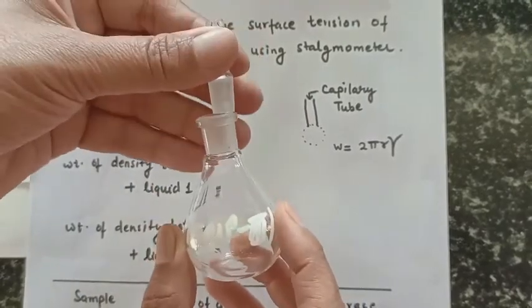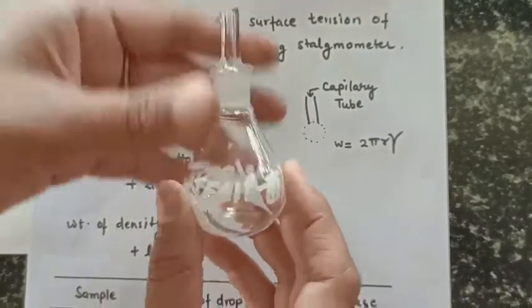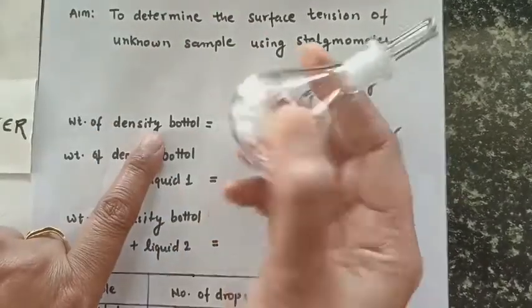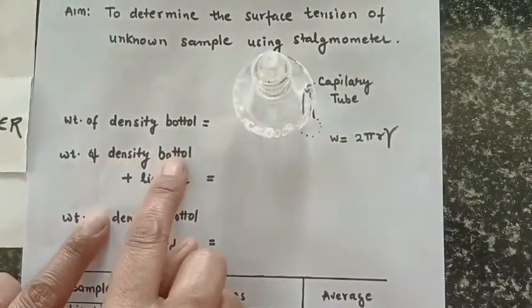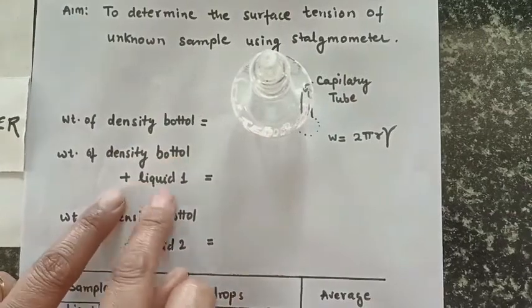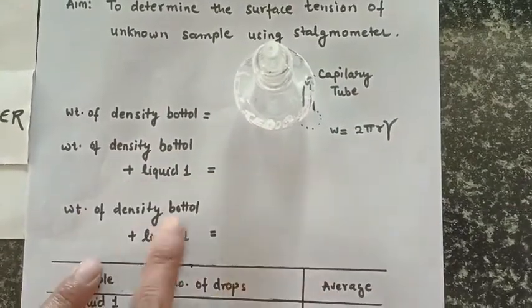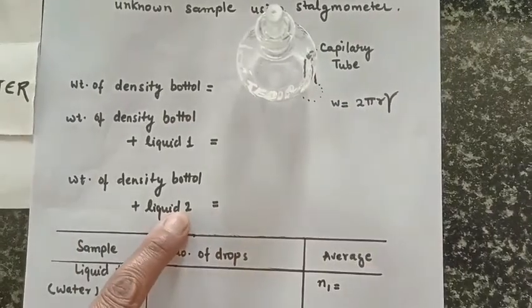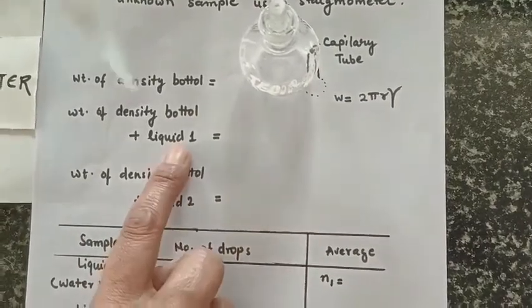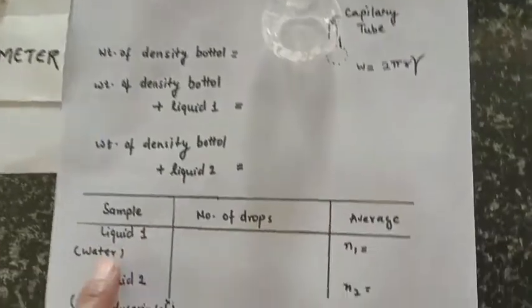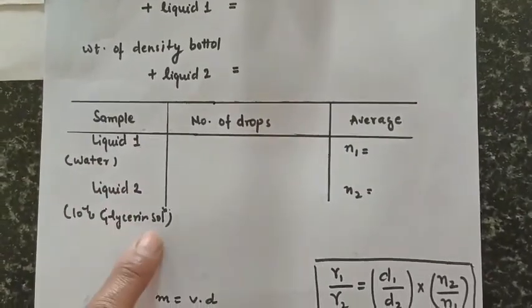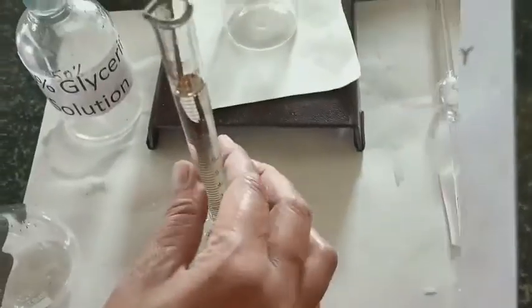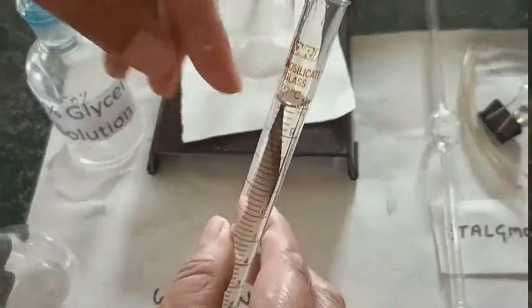To determine density or weight, we need this density bottle. This is an empty density bottle — we fill it with liquid one, take the weight, then fill it with liquid two and take the weight. Liquid one is distilled water and liquid two is 10% glycerine solution.